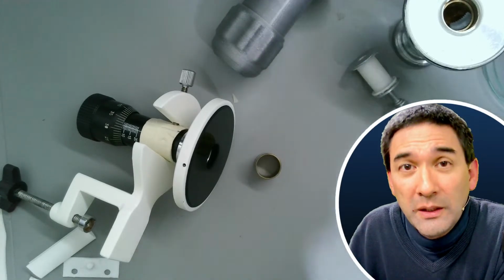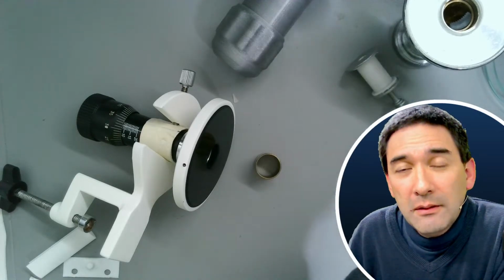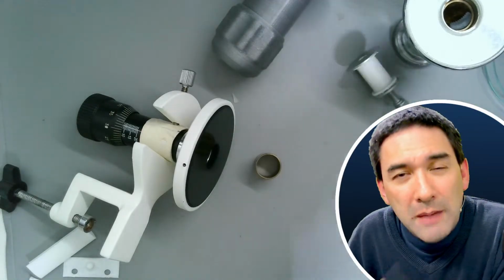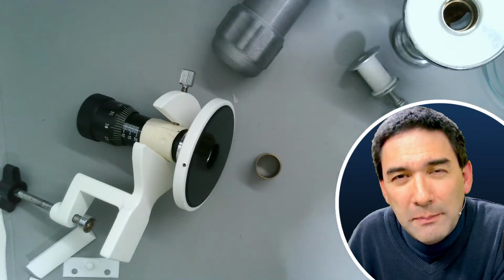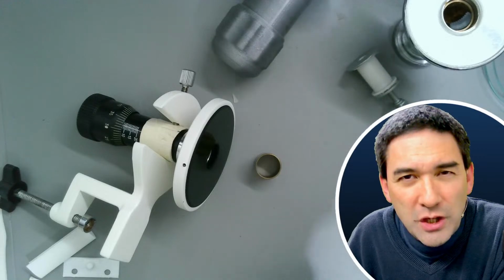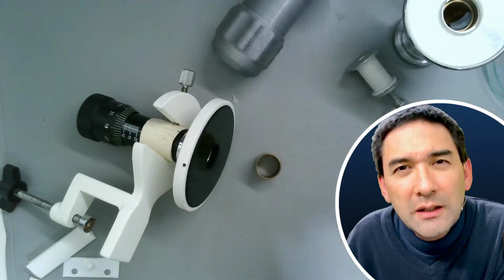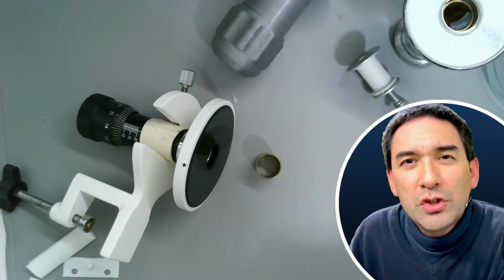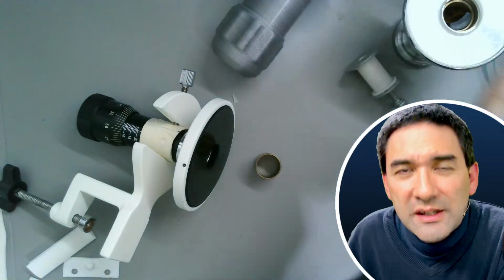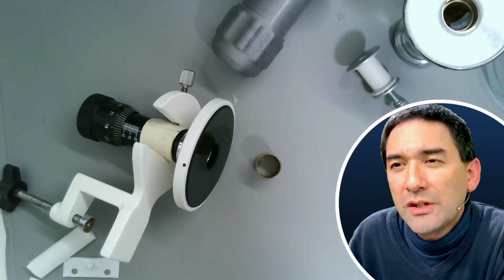Then it's really humid. So what I would say, and maybe somebody please correct me, is that it's maybe not so necessary to keep it in a humidity chamber or a dry chamber. How would you do that? But rather make sure that the temperature is reasonably constantly low. And if you're using air conditioning, just make sure that it cools down the room constantly, and that you don't have temperature changes, right?